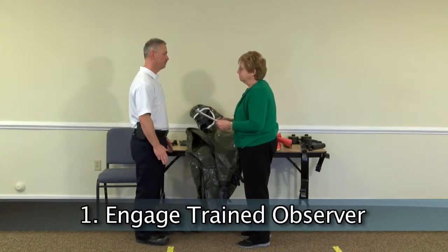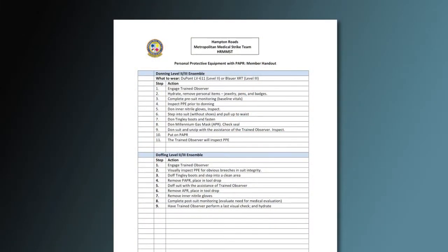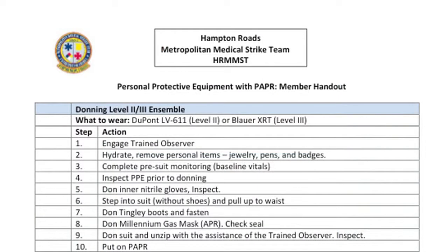Engage the trained observer. The trained observer uses verbal commands and a written checklist to confirm each step of donning PPE and can assist with ensuring and verifying the integrity of the ensemble.